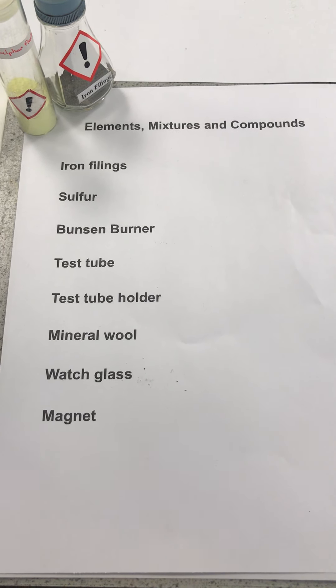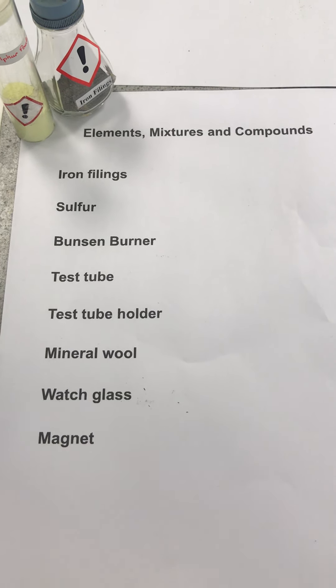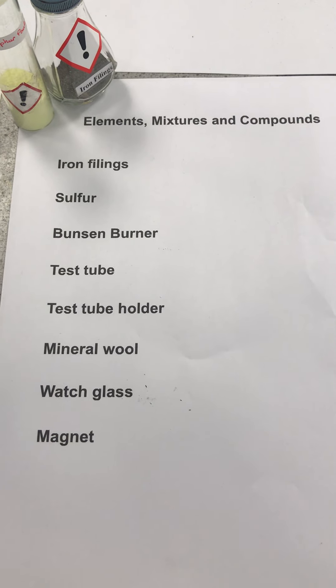In this video we will show you how to make a compound by doing an experiment with two different elements: iron and sulfur.